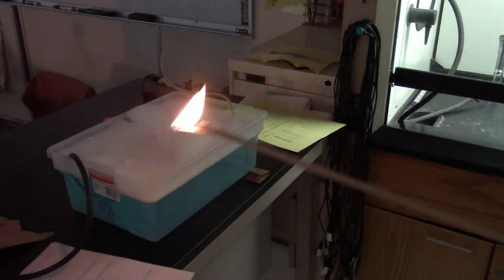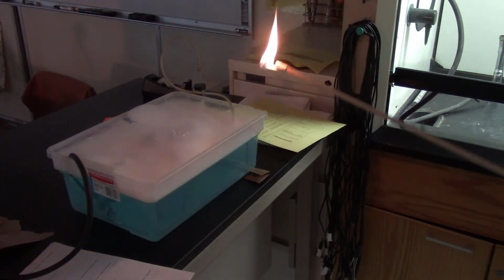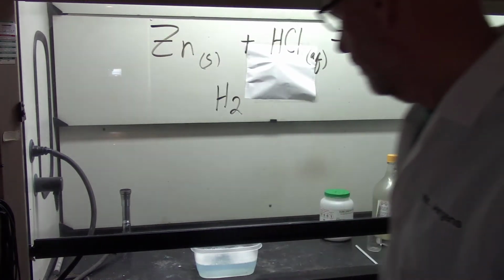There they go. And I'm going to hide back here just a little ways and see if anything happens. Yep. So what do you suppose that reaction was?